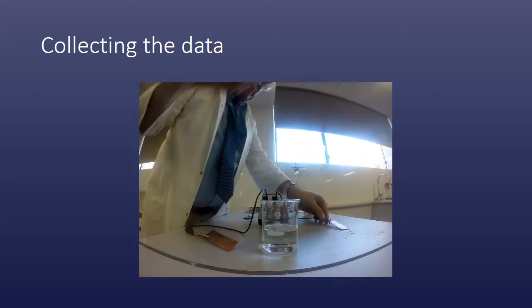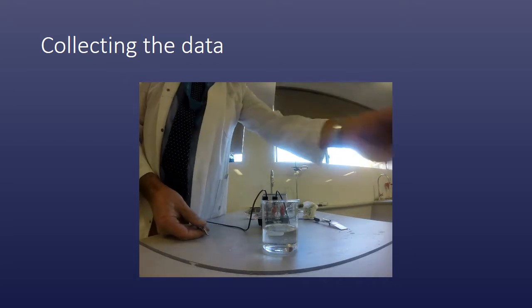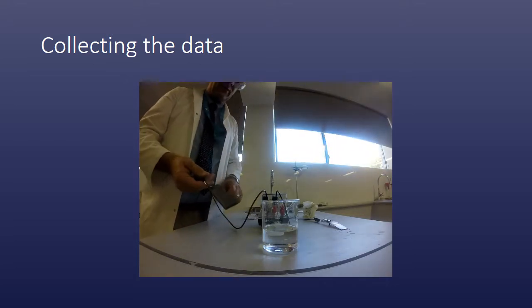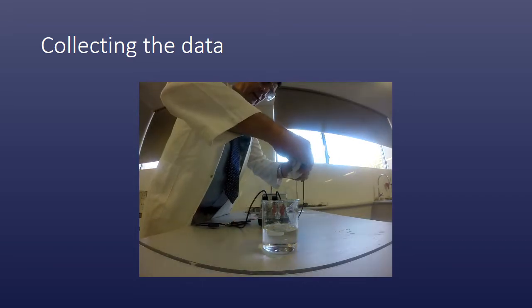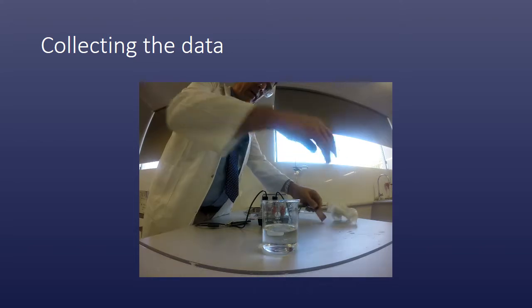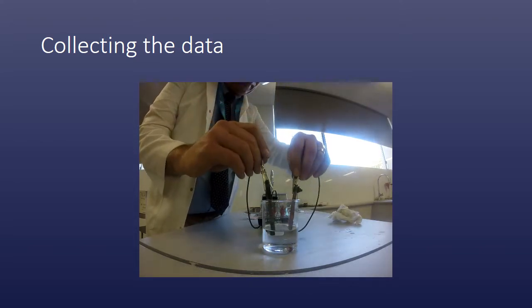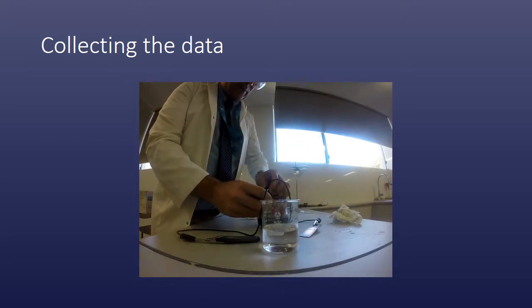But the problem with the zinc was bubbling away and interacting by displacing the hydrogen in solution. So what if I use something that is inert, like carbon, a graphite electrode, which again I've dried and given a bit of a quick rub. So let's see what happens with this one. Oop. It's fallen back negative, so let's just switch these over.